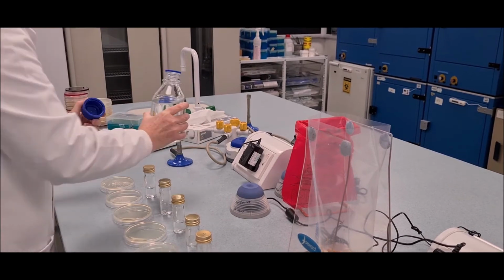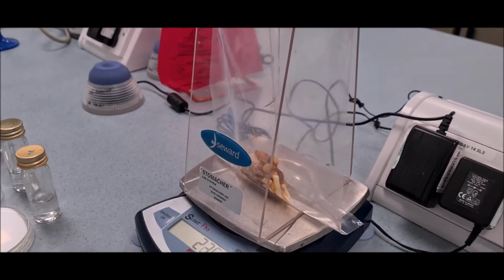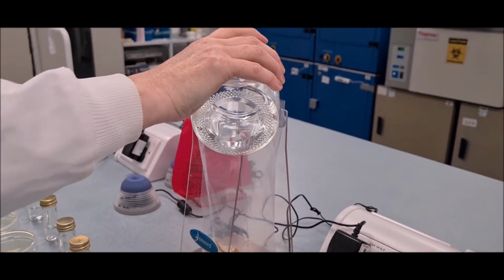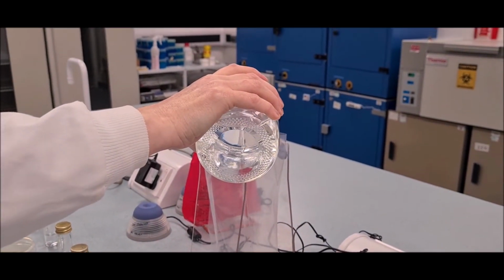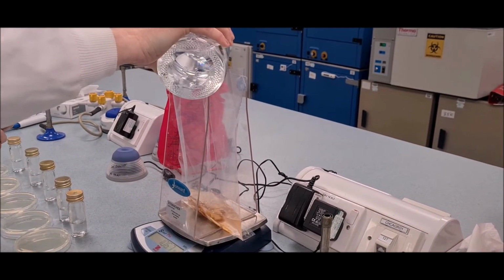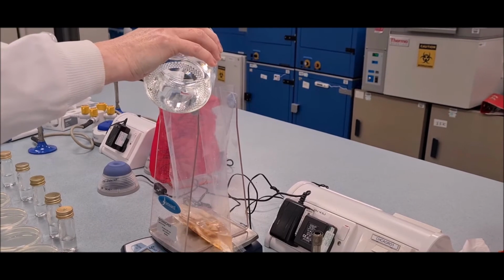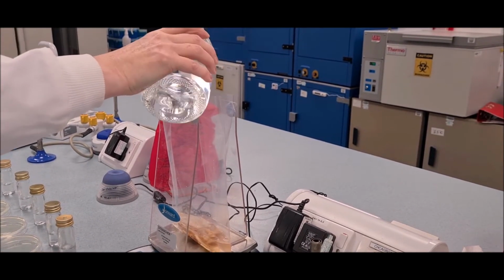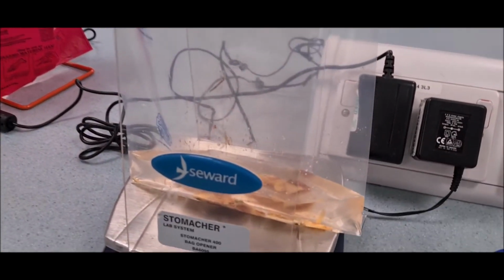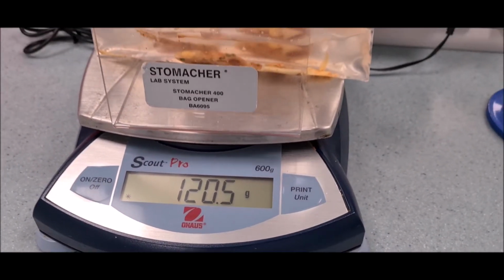3. Add Ringer's solution to the bag. Make a 1 in 10 dilution. Example, for a 10 gram sample, add 90 grams of Ringer's solution. In this demonstration, we have weighed 12 grams of food sample. To determine the amount of Ringer's solution to add to the food sample to get the required dilution, multiply 12 by 9. This gives us 108. That means the total weight will be 12 grams plus 108 grams, which gives us 120 grams. This is the same as 12 multiplied by 10. So simply add the Ringer's solution to the food to give a final weight of approximately 120 grams.